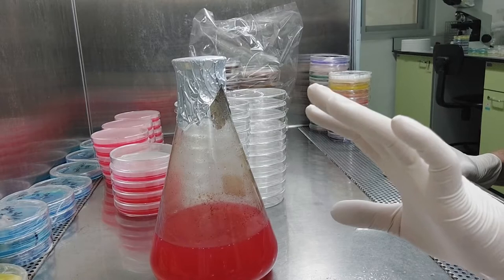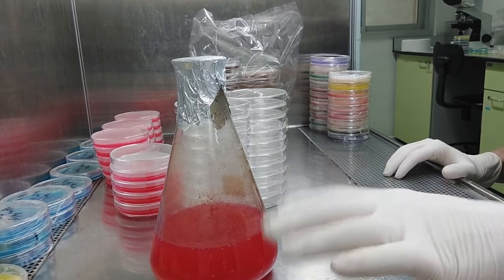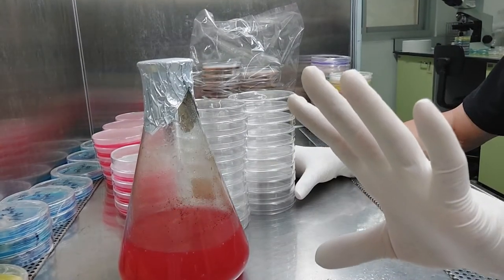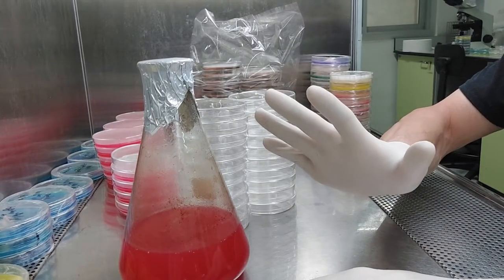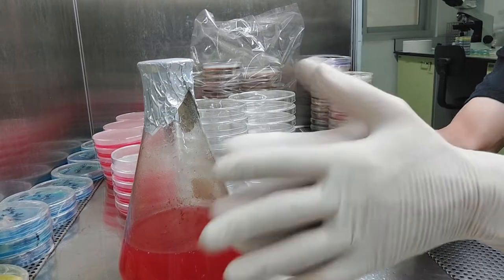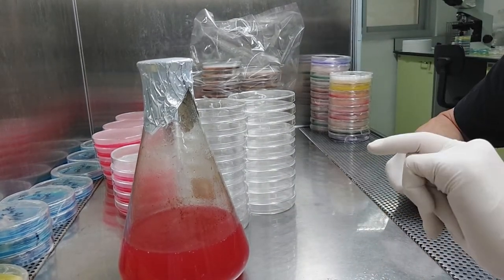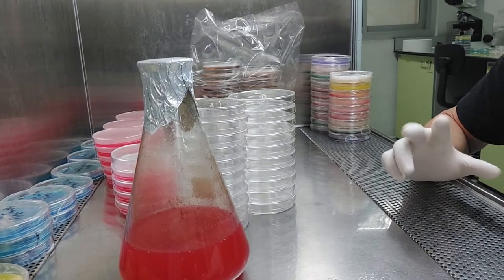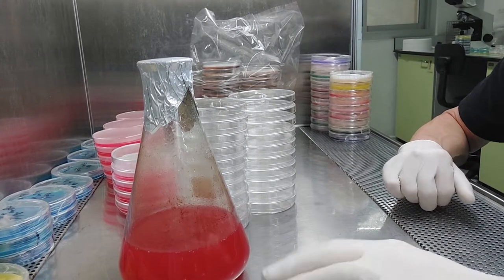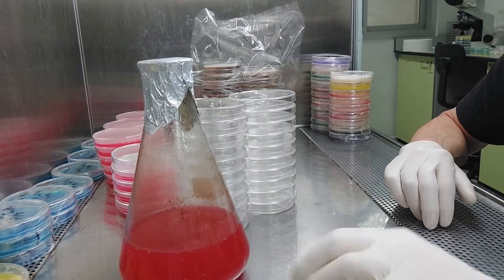You'll never see anybody in a lab not wearing gloves doing this. For people who say they want to save resources — you can reuse gloves. Just spray them with alcohol, literally wash them while you're wearing them, soap them up, wash them, let them dry, use them again. If you don't wear gloves to pour agar plates, it means you've never worked in a lab and don't know the proper way to do it. Every time you touch the edge of a plate without gloves, you're introducing contamination — fingerprints, skin cells, whatever dirt you've touched.